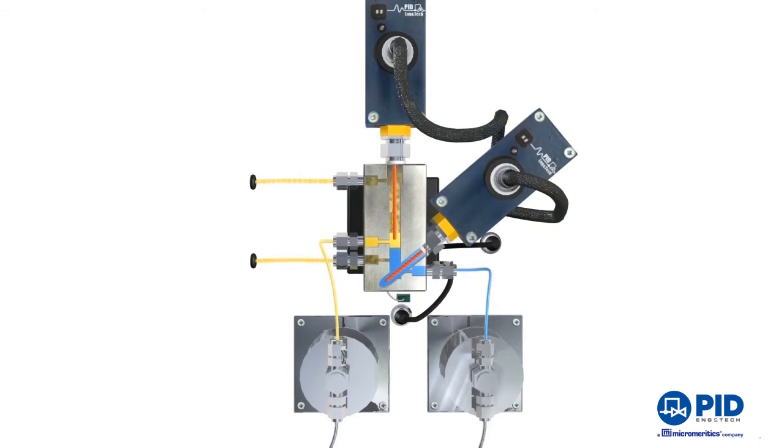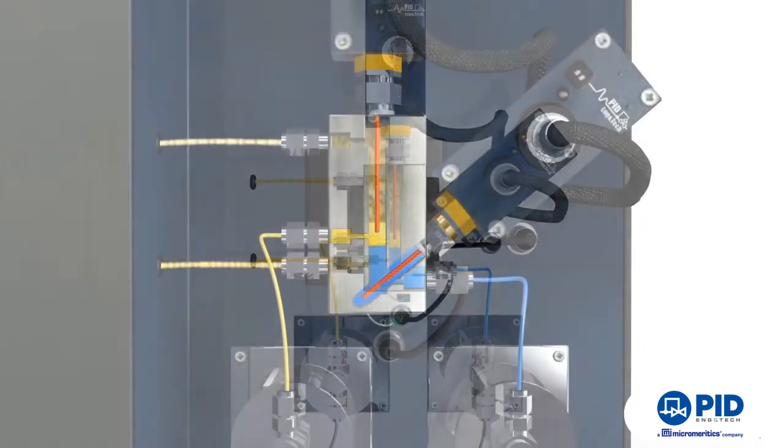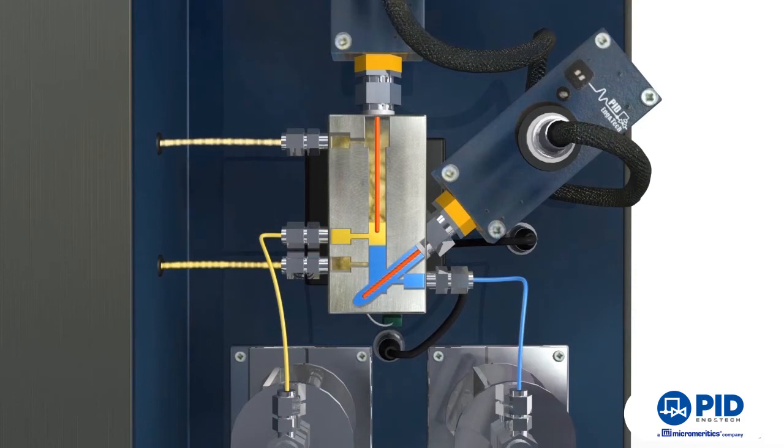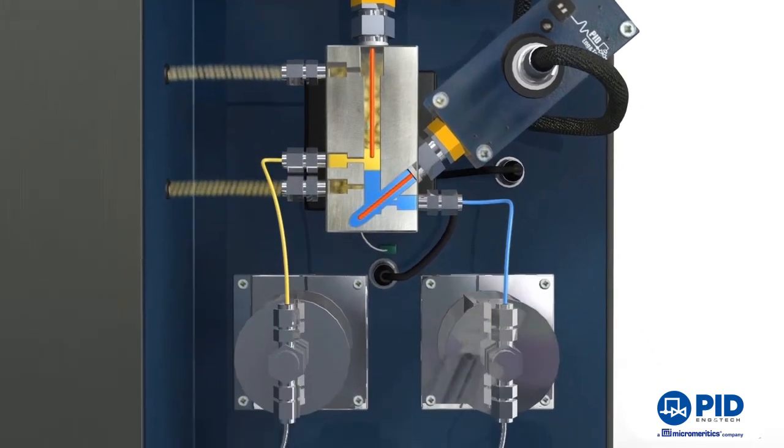Thanks to this patented design, when the reaction product enters, the cooling effect of the Peltier cell makes liquids condense. As they are non-miscible, water drops go to the bottom, creating a hydrostatic seal in its outlet as the level reaches a minimum value, as well as hydrocarbons, which create another seal in the second outlet. This way, each sensor reads the level corresponding to one liquid, sending a different signal to the level control valves placed at each outlet.